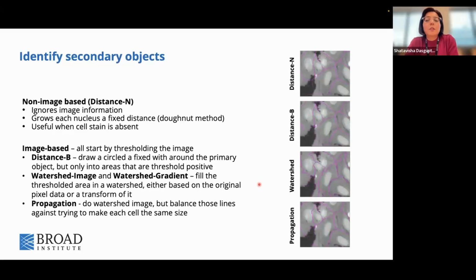And one of the principles that these use is watershed, which basically means that the software reads the image as containing some crests and some troughs, crests being the areas of the higher intensity and troughs being the ones of the lower intensity. And then it starts filling these troughs in a way till the point that it almost spills over to the next trough. And at this exact point of spillover would be the region where a boundary would be applied between two secondary objects.